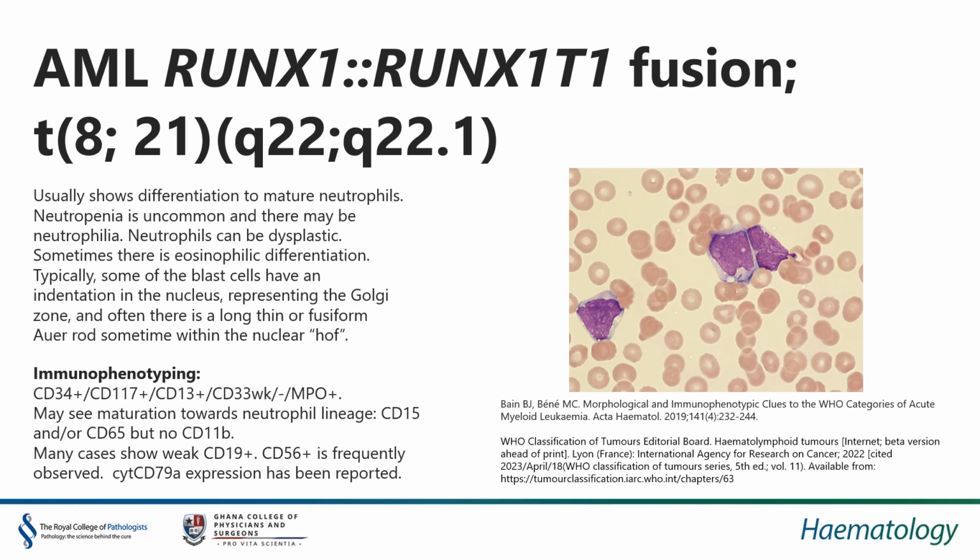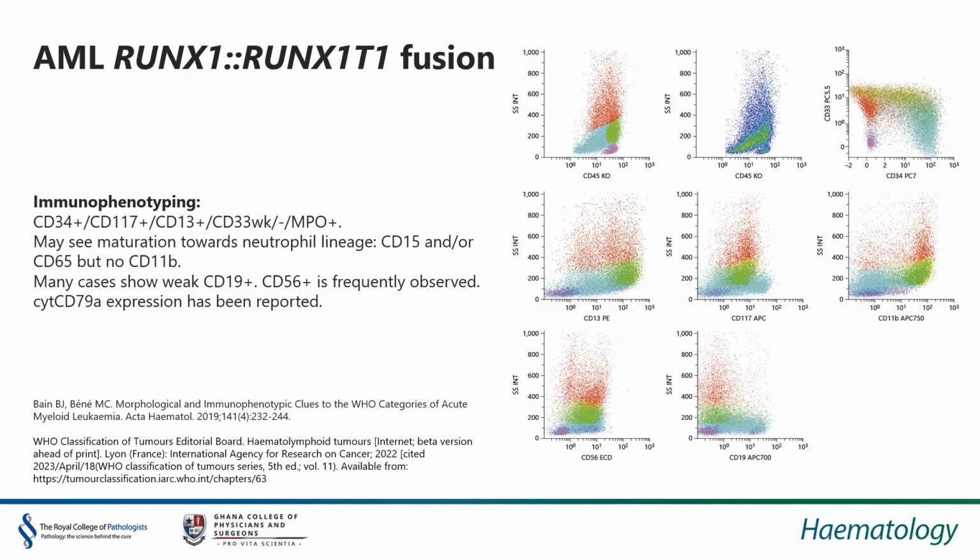So within these plots on the right hand side, we've got the red neutrophils, the monocytes are in green, and this can be confirmed by expression of say CD14 and CD36, which isn't shown here, and you can otherwise be interpreted as degranulating neutrophils. In the cyan color, the blue color, we've got the blast cells, and in magenta we've got the lymphocytes. You can see that there are two distinct populations of monocytes and blast cells, although they almost sort of form a continuum from one running into the other.